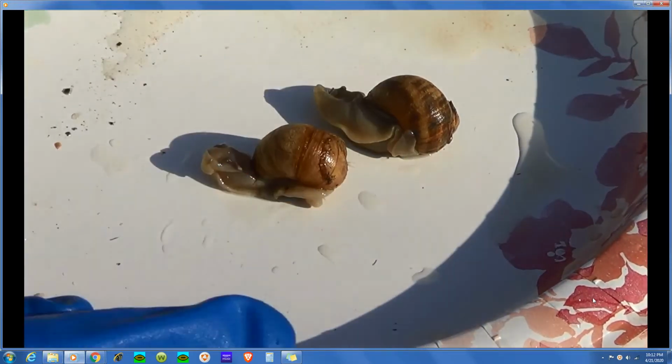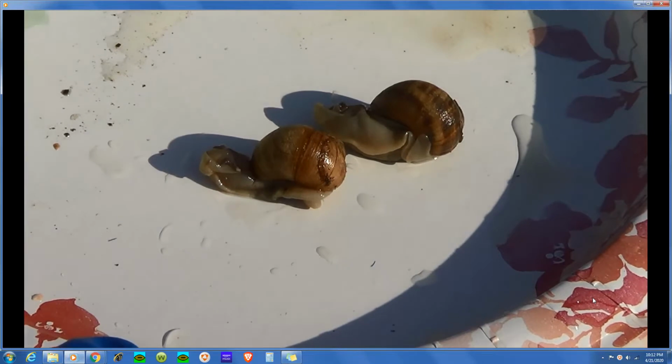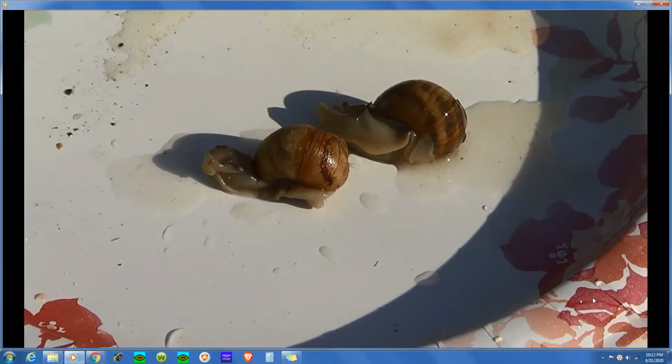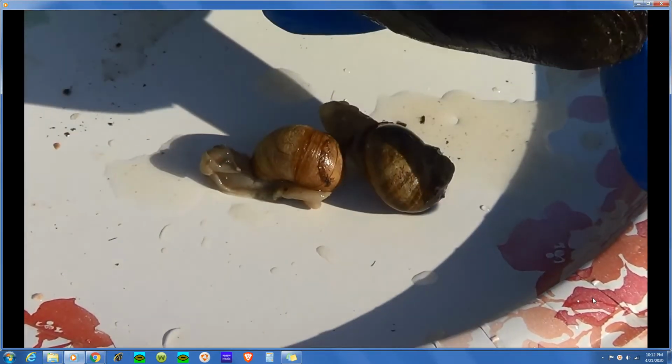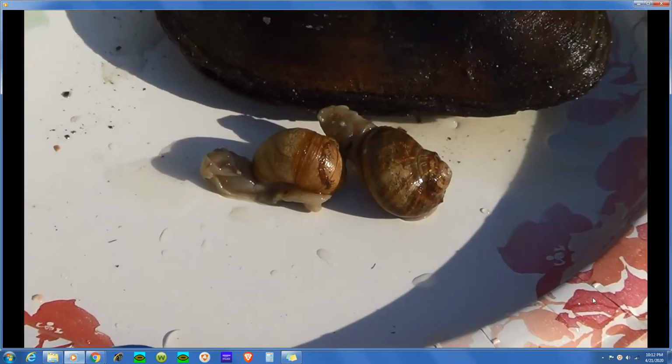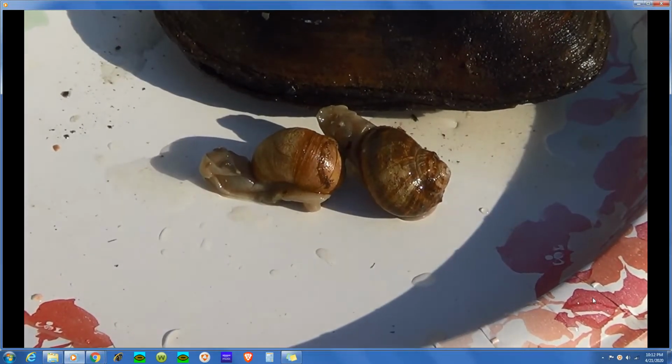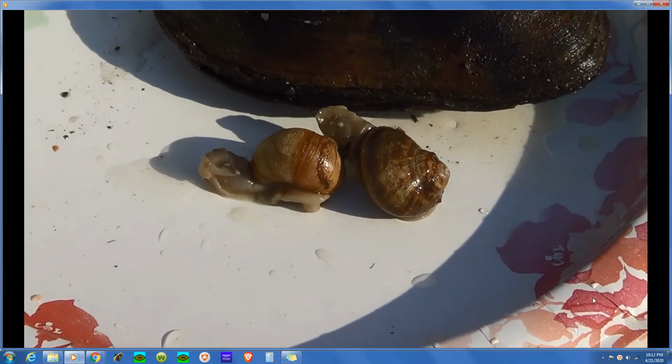Gastropods, which are slugs and snails, and you can see I've got a couple of snails here. This is a terrestrial snail called Helix. And we have some freshwater mussels, as you might find in say Lake Michigan and other Great Lakes region. So we're going to look at them internally, and then I've got the squid over here, and I've got actually two of them. One of them is a real big one, so we're going to have to do some adjusting of the camera to be able to get that all on camera.